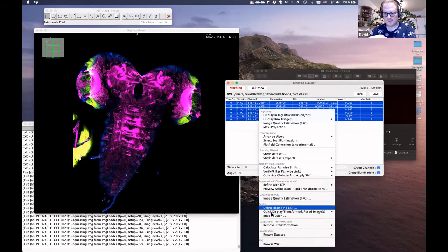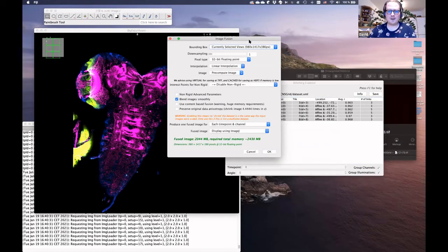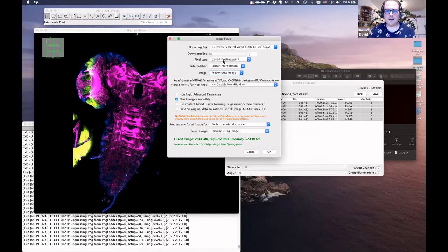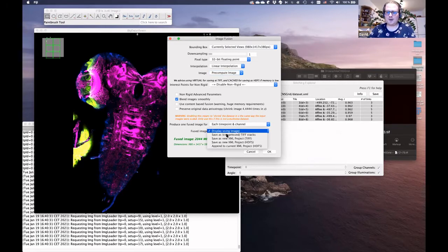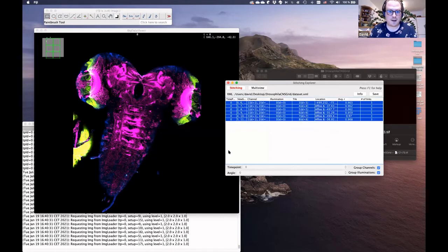In the more advanced image fusion dialog, you can also set it to pre-compute the image if you want to save it right away. You can choose the pixel type — 32-bit or 16-bit — and display the images in ImageJ or immediately save them to disk. With this, the demo is complete.